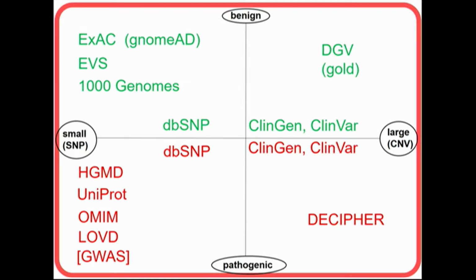And so I want to show you later how to use sessions as a way to save your train of thought. When you're thinking about this kind of data, you can pop right directly into a session that has those on, and then navigate to the gene you're interested in. And you don't have to remember where to find all of the different data sets. You can save your thinking as you go.